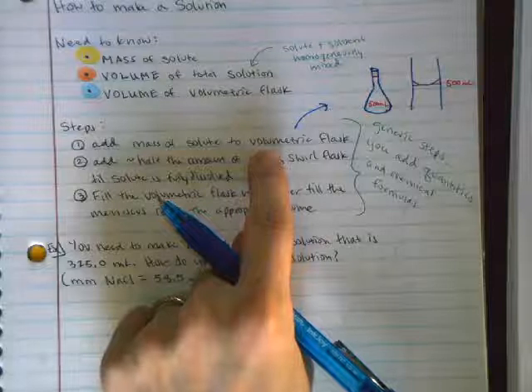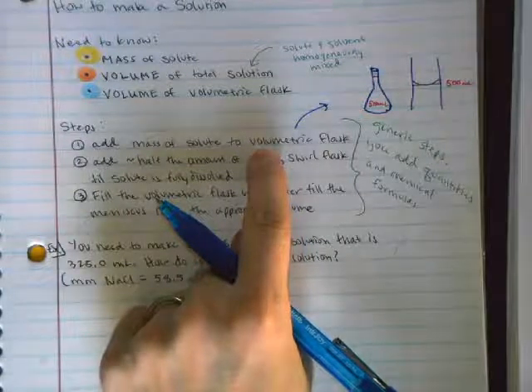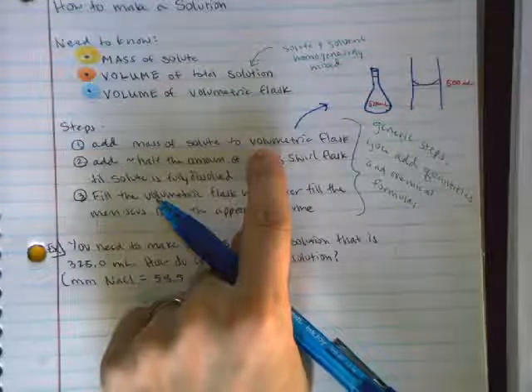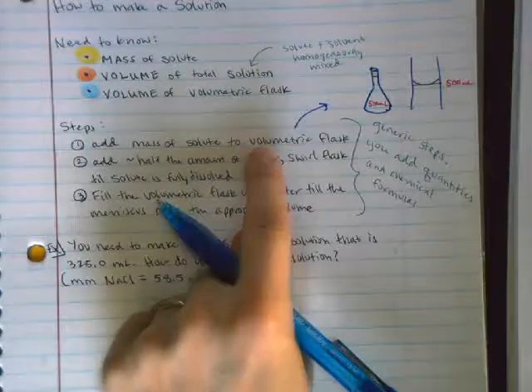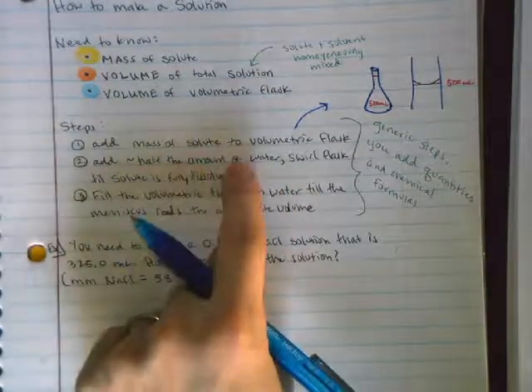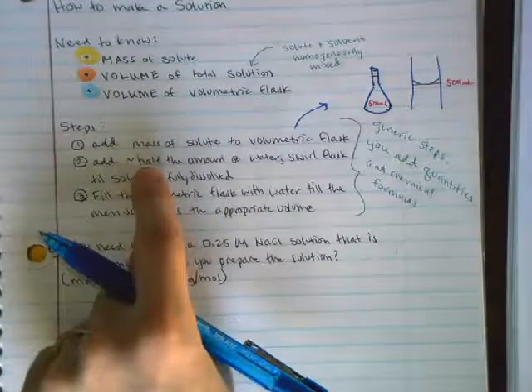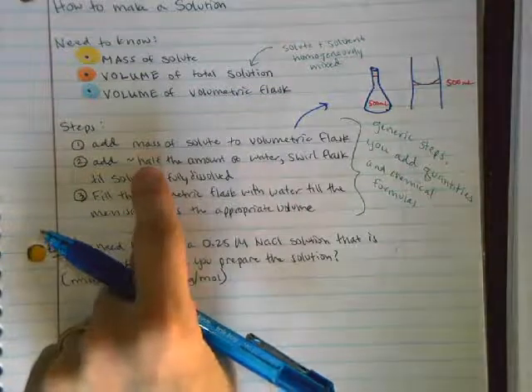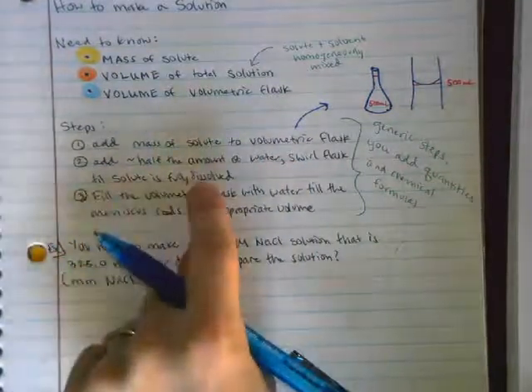Ideally, you would even measure it straight into that volumetric flask so that you're not leaving some of the solute behind on a piece of weighing paper. Okay. Now you've got your dry solute in your volumetric flask, you're going to add about half the amount of water. So if it's a 500 milliliter solution, maybe I'd add about 250 milliliters of water. I'm not going to measure it, I'm just going to add it. And then I swirl the flask until the solute is fully dissolved.